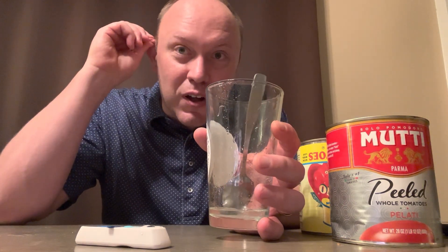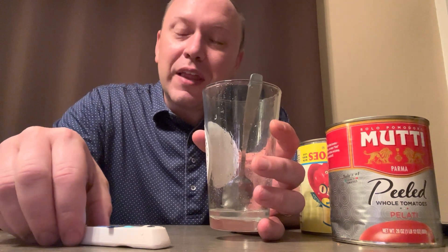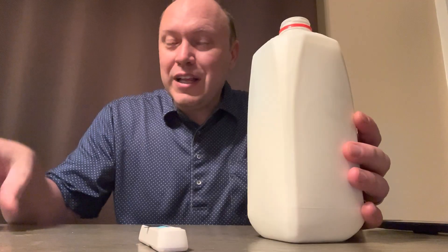Just for fun, what I did here was I took two teaspoons of water, a teaspoon of sugar, and mixed it as best I could. Now it's not fully dissolved here, but that came in at 22.9% sucrose. Let's do some milk — this is vitamin D milk — and that comes in at 15.8%. I will say all the other ingredients I've used so far were at room temperature, 70 degrees, while this was in the fridge at 39 degrees.